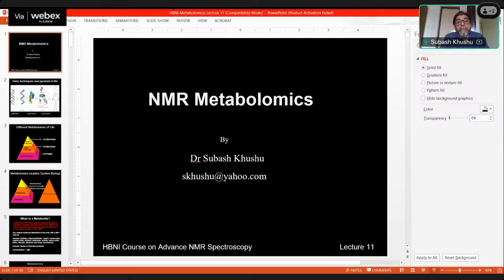Sample recovery: in NMR, it is non-destructive. That means you can use the sample for NMR and then store it back at cryogenic temperatures, and you can subsequently use it many times in future. However, in MS the sample is destructive, and you cannot use it again because you are already consuming the sample. Analytical reproducibility is very high in NMR, and it is fair in MS.